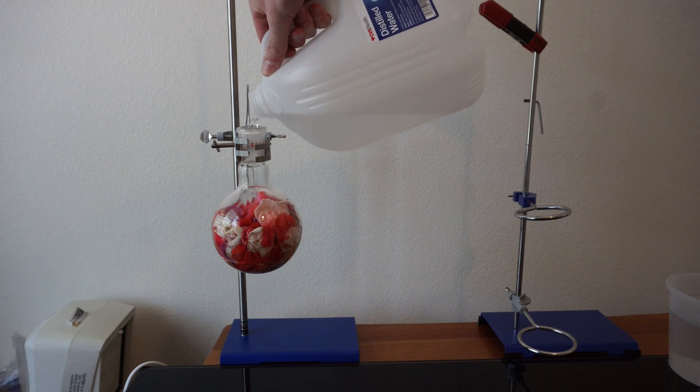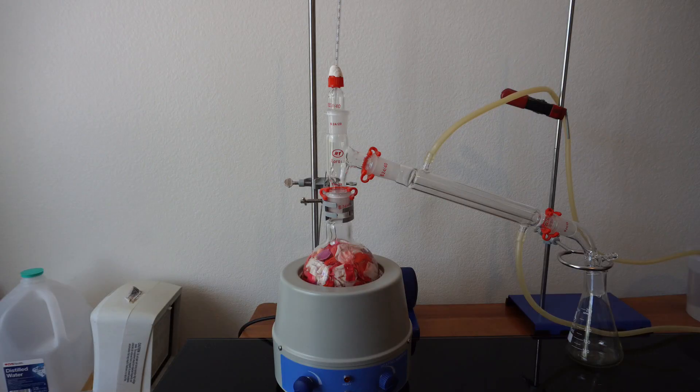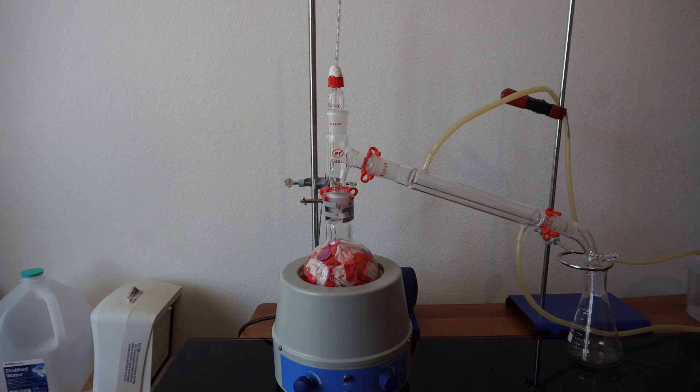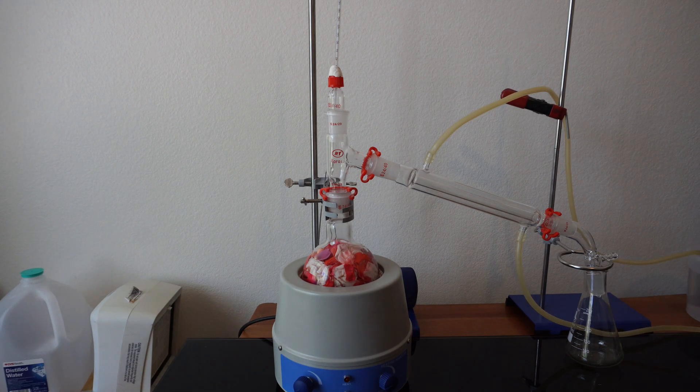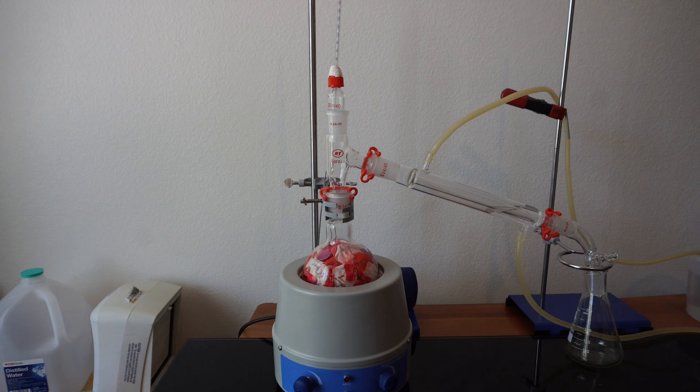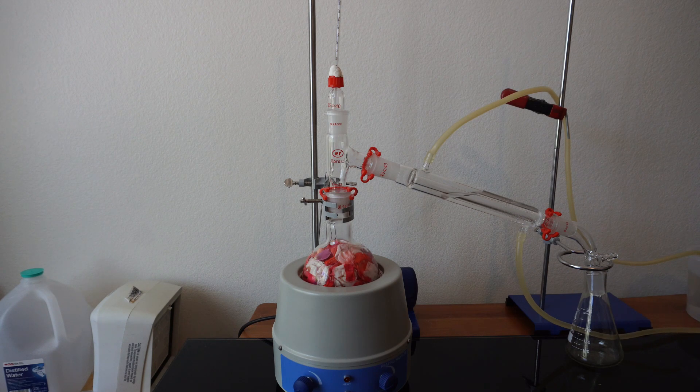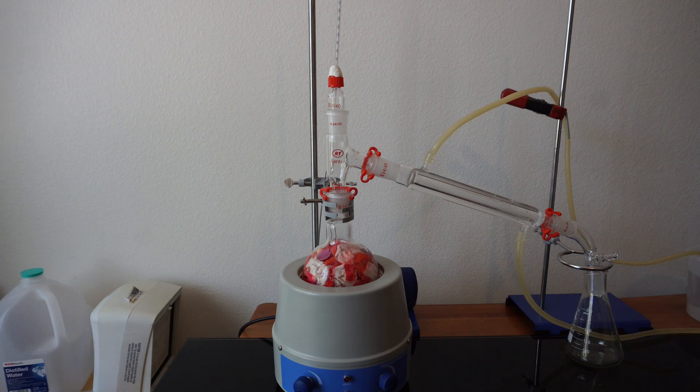Luckily, my neighbor grows roses, so she lent me some for this video. We picked all the petals from the roses and added them to the boiling flask, followed by just enough water to cover the petals. We then set up our still and filled the condenser with cold water, followed by turning on the heating mantle.